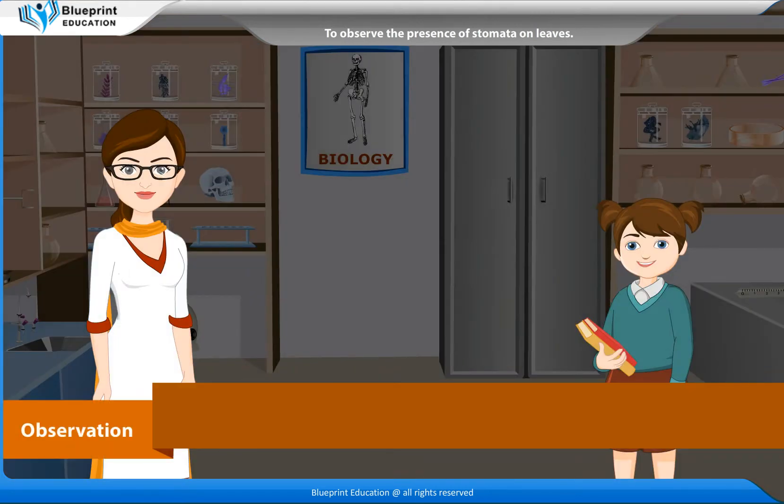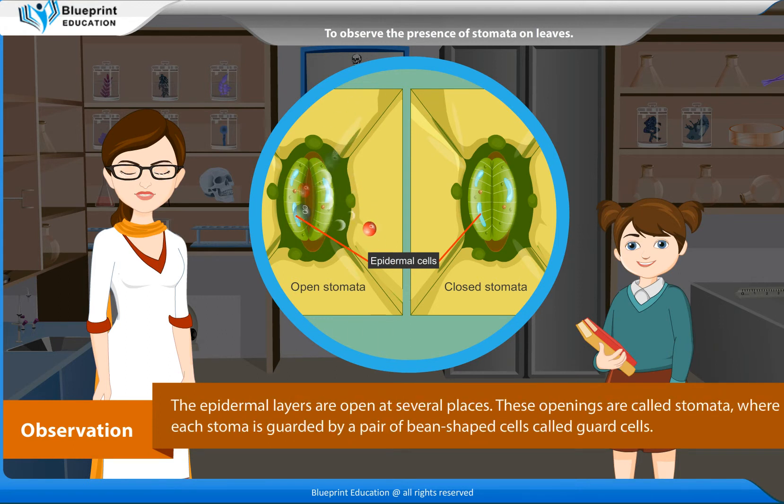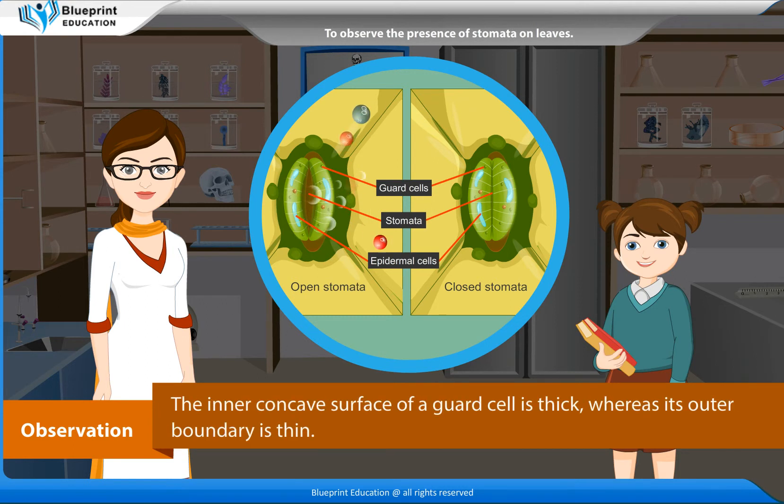Observations: The epidermal cells are visible. They are closely packed and have a distinct cell wall, a nucleus, and a cytoplasm. The epidermal layer is open at several places; these openings are called stomata, where each stoma is guarded by a pair of bean-shaped cells called guard cells.